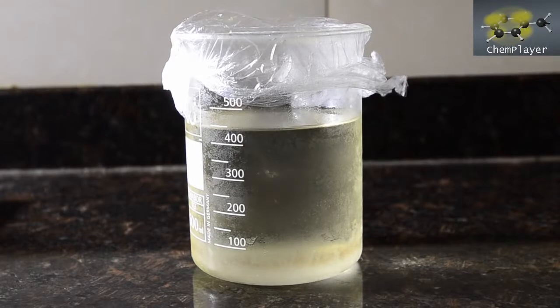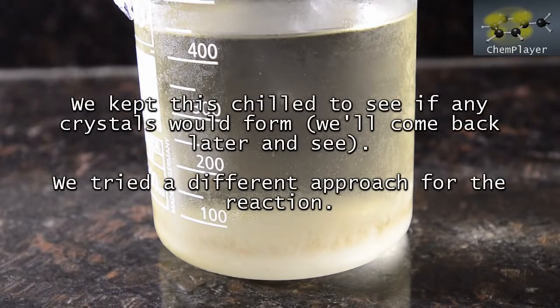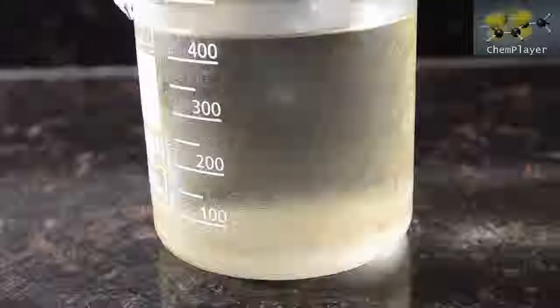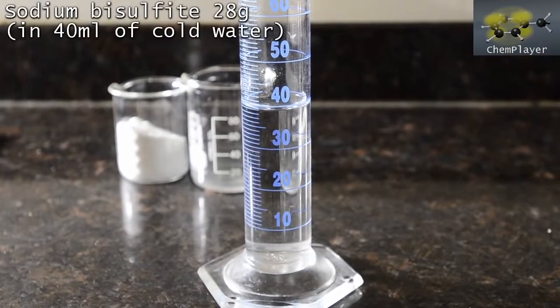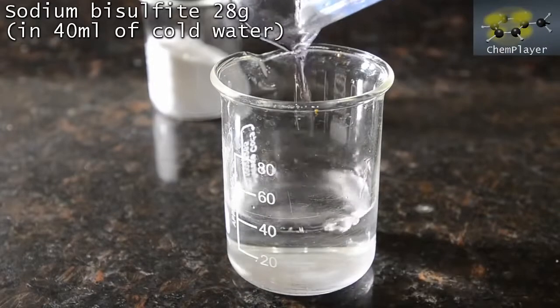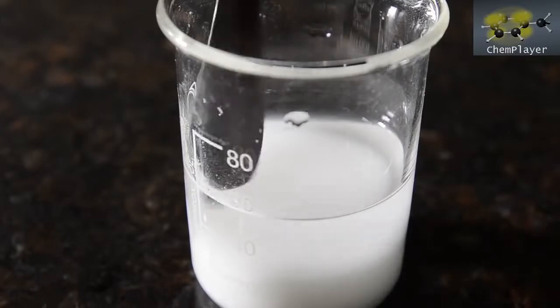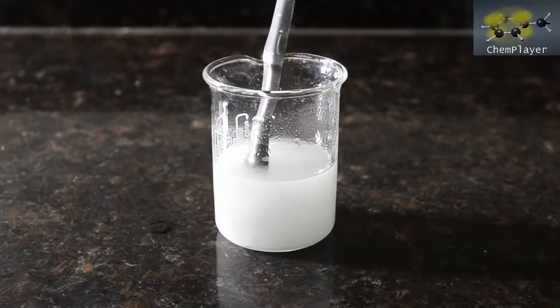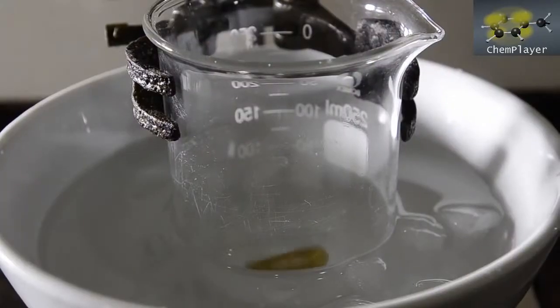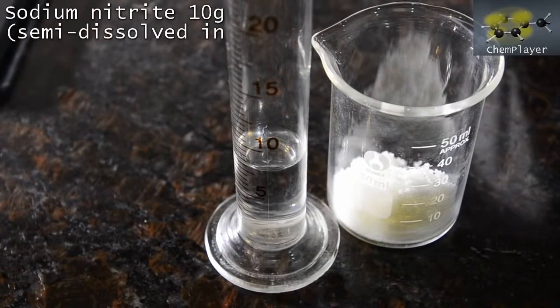This means we must be doing something wrong in the reaction. So we had another go at the reaction only using a smaller scale, and this time using as little water as possible. So we mixed 28 grams of sodium bisulfite with 40 ml of water and stirred to form a slurry. Not all of the solid dissolved, but we left the mixture as it was. Then we prepared a beaker and a very cold ice bath, and added 10 grams of sodium nitrite and just 8 ml of water.